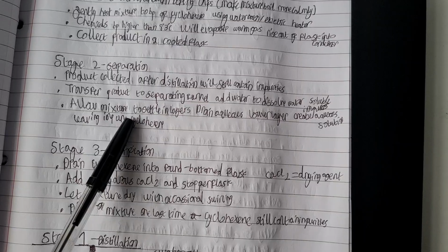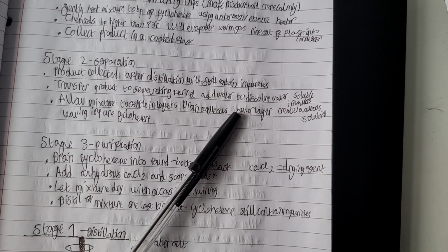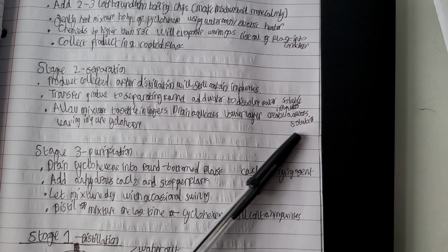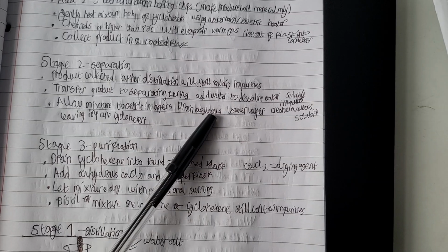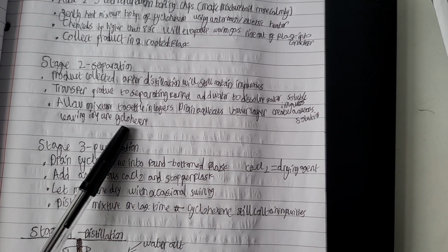Then we want to allow the mixture to settle into layers, and we want to drain the aqueous lower layer, as this creates an aqueous solution, leaving the impure cyclohexene.